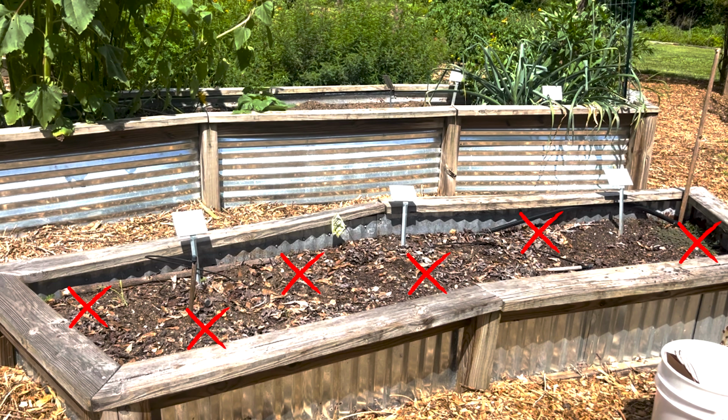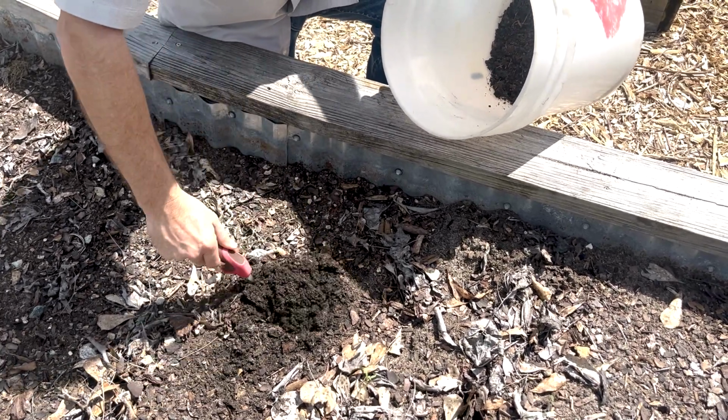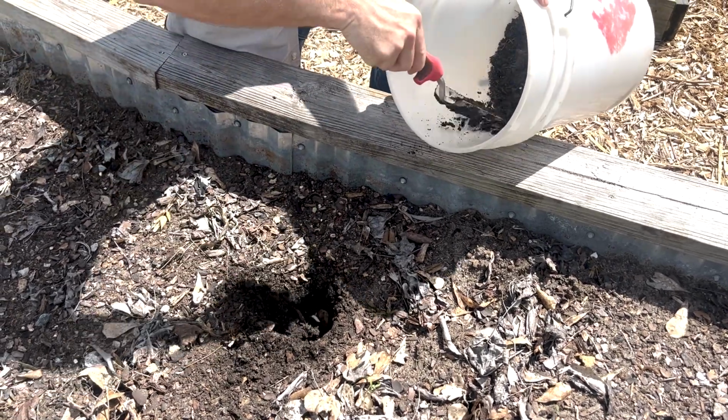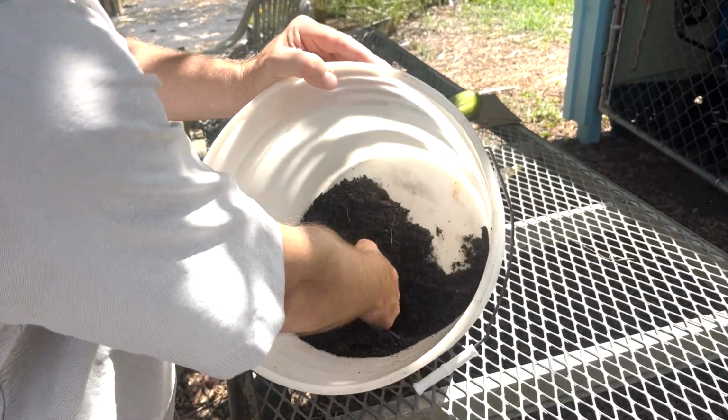This collection is very similar to the previous test. Locate your area of interest and plan to collect around 4 to 6 samples, all from around a depth of 6 inches. Thoroughly mix all of your samples together and remove any debris.